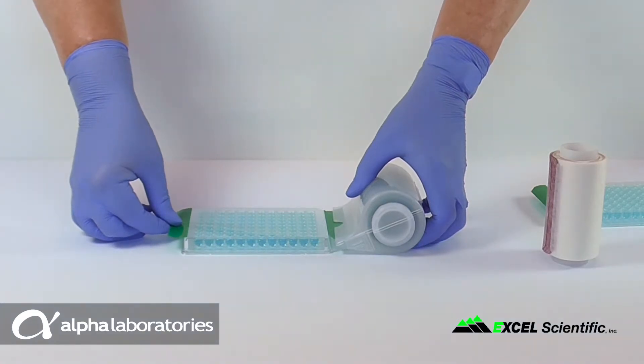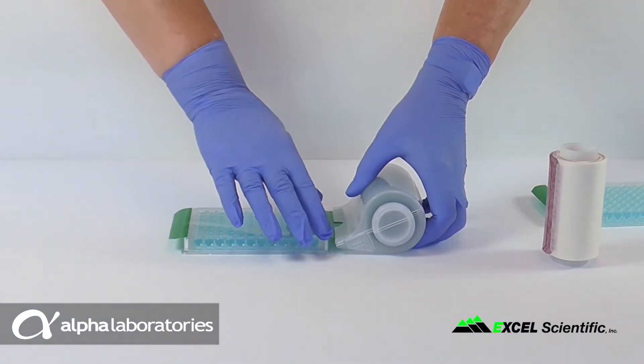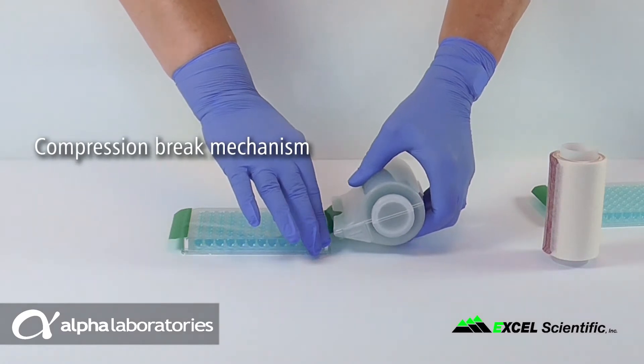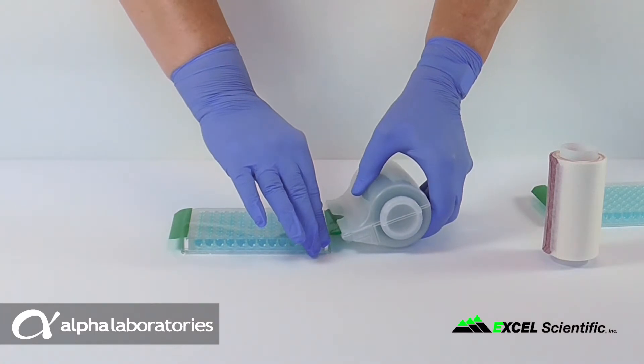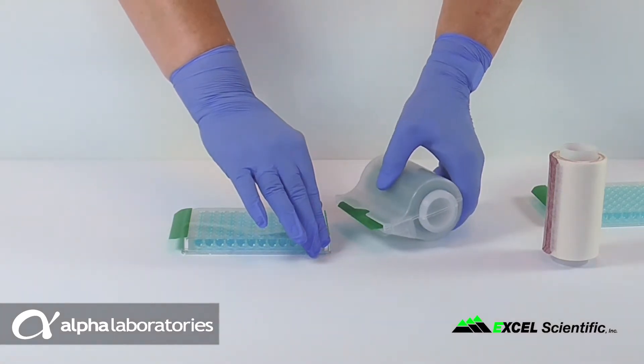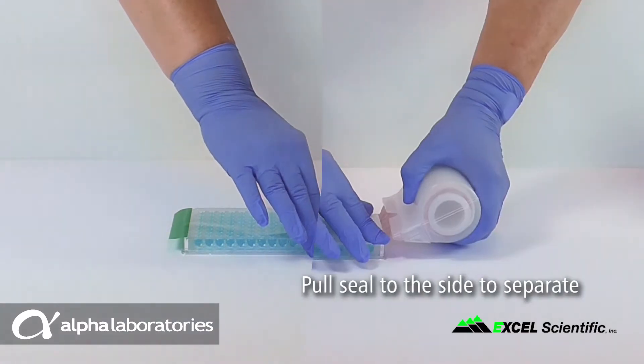Several unique features contribute to the ease and usability of the SealMate dispenser. A compression break mechanism prevents the roll from turning as the dispensed sheet is separated from it. To tear the perforation it is important to pull the seal to the side rather than upwards.